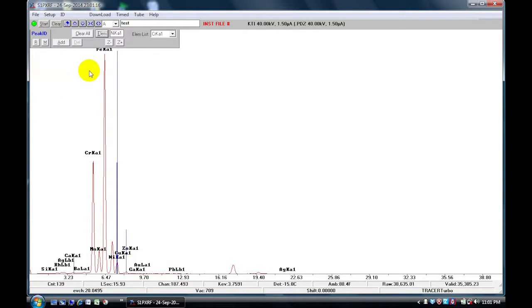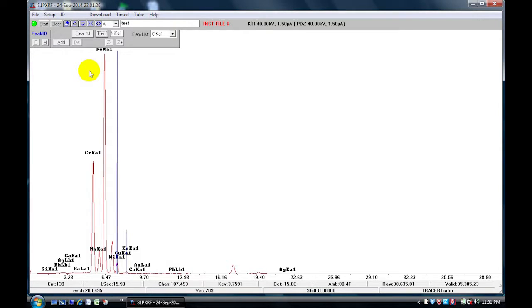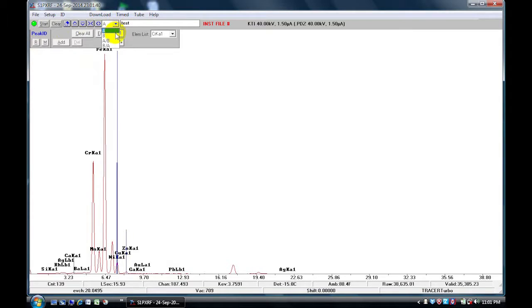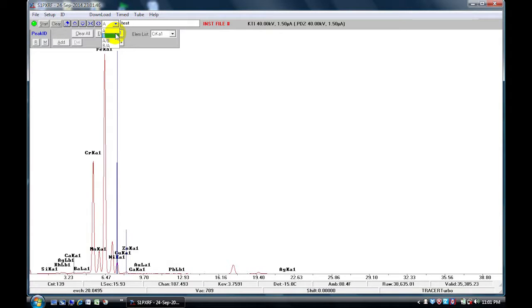Now there are several ways to compare peaks. The S1PXRF software can overlay at a maximum two spectra. So in this drop down, you will notice that we have A, B, A over B, and B over A. So Spectra 1 is A and Spectra 2 is B.